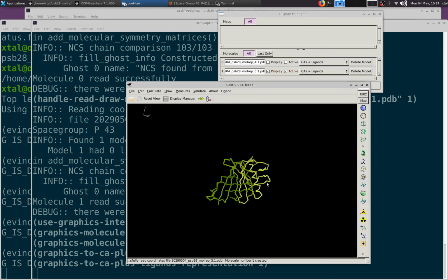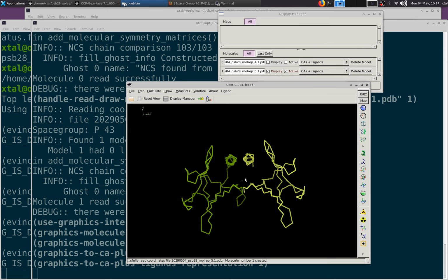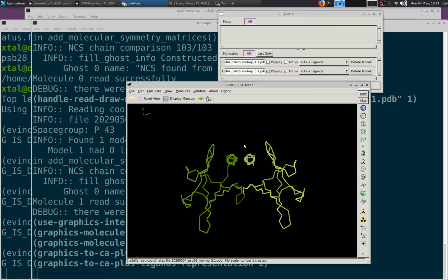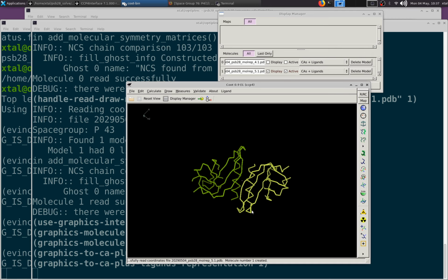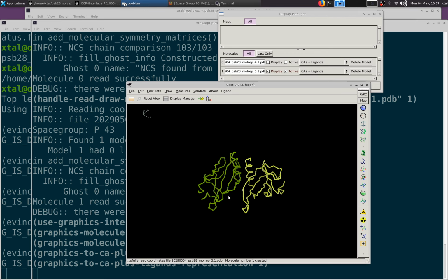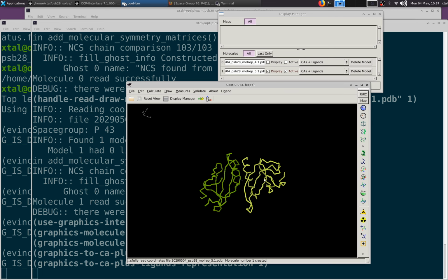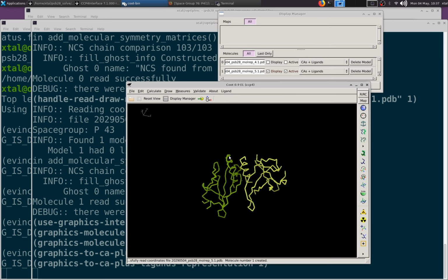Now, I actually happen to know that there are 2 dimers, and this is the biological dimer because I've done this molecular replacement before, and at the time I was very pleased with myself for spotting this, because finding 4 copies individually, basically Phaser at the time didn't work. So this is a way of shortcutting the solution, because the search for these 2 dimers will be very quick.